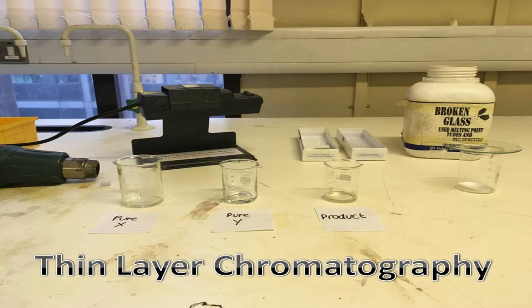Thin layer chromatography, also known as TLC, is an analytical technique that separates compounds in a mixture.